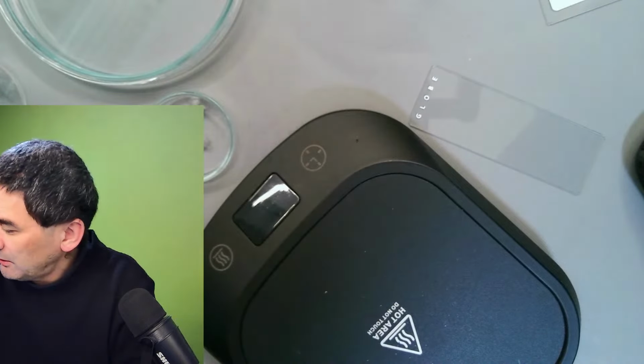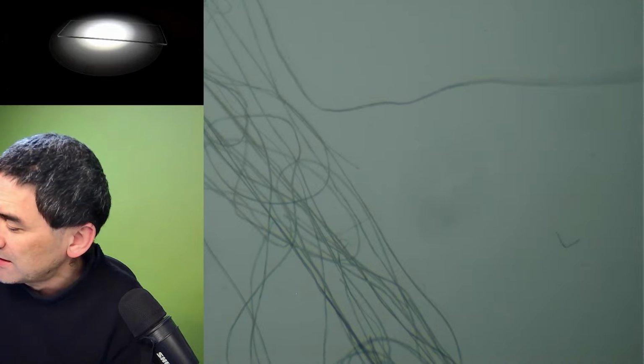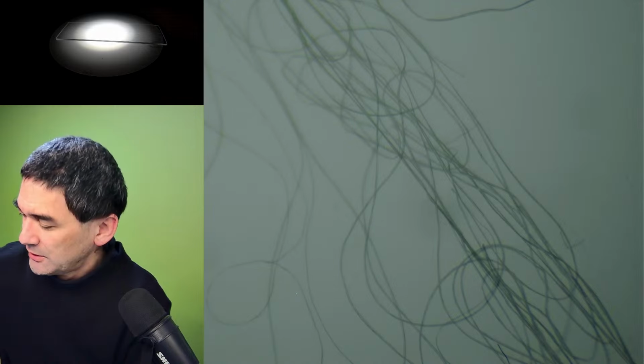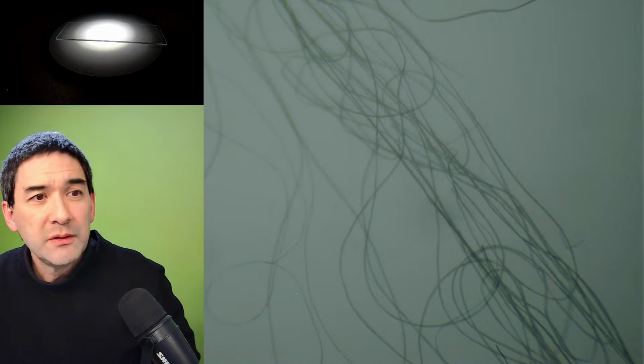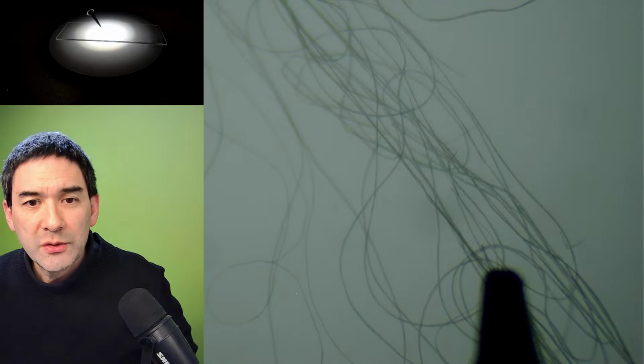Yep. And this is where the contrast is probably going to be a bit bad. Okay, so this is now, let's see. Again, I have to focus this a little bit. It does kind of work. Okay, so that's the cotton right now, right? And the soldering iron has been set to 300 degrees. Okay, I better not burn myself. You can maybe follow a little bit at the top what's going on. I know it's a little too dark, but you see I've got the soldering iron here. And I will try to now touch the cotton.